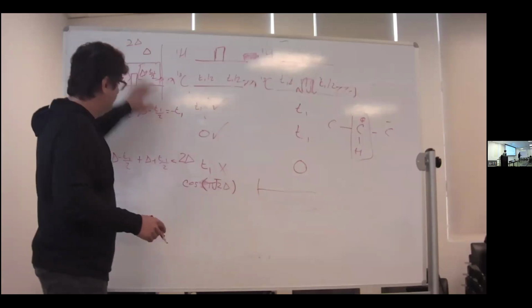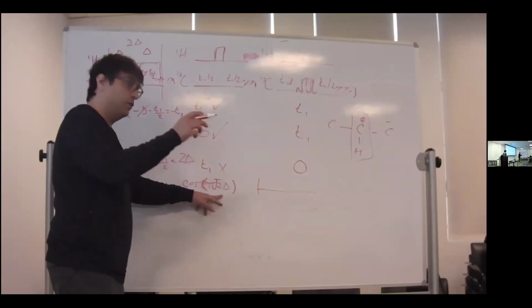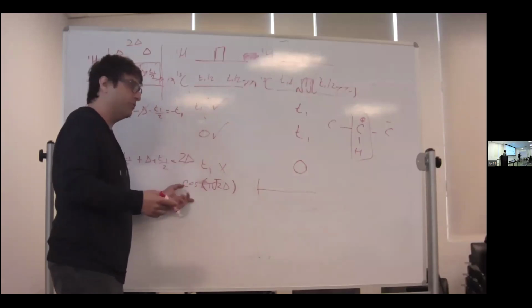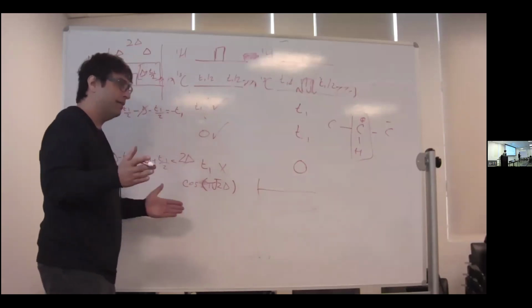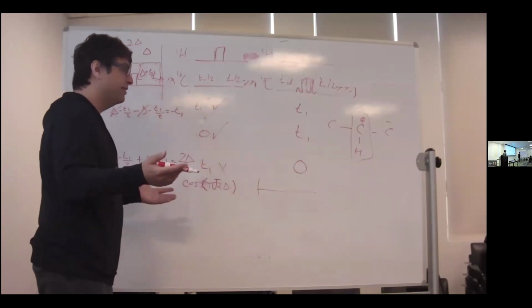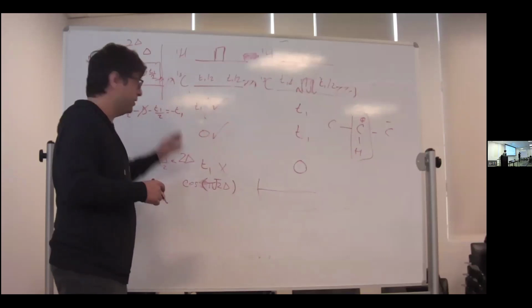But all along this, let's go back to the simple case that we set it to pi. And we get a number of 1, we get a nice signal. Is my signal intact? Truly, I'm not losing anything from delta. So it sounds like the coupling evolution is 1. What's happening during this experiment?